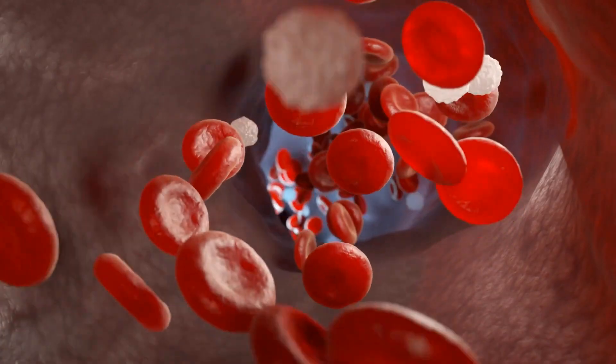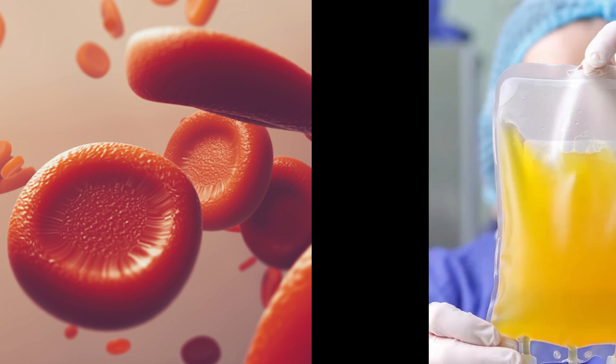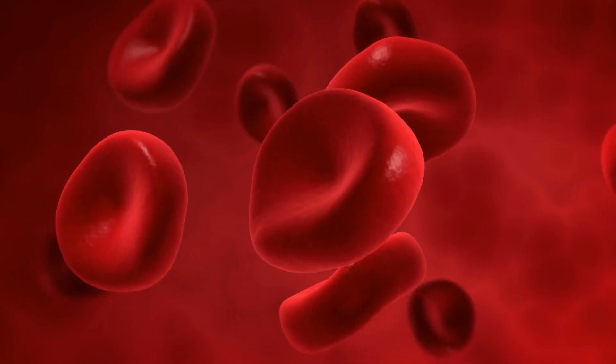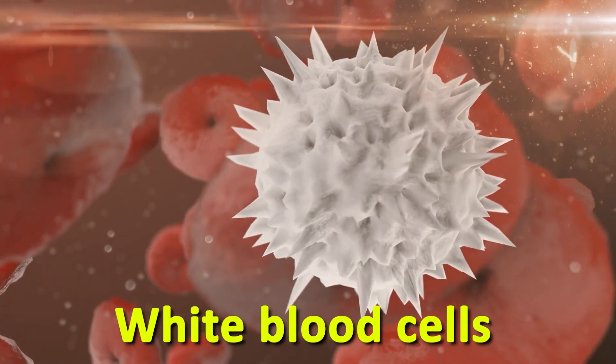Human blood can be divided into two parts, the solid part and the liquid part. The solid part of your blood is red blood cells, white blood cells, and platelets.